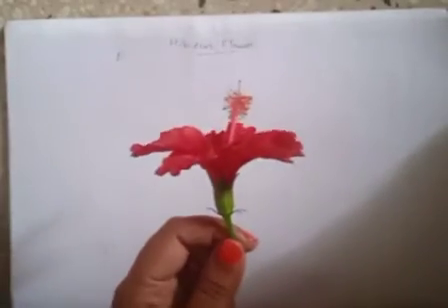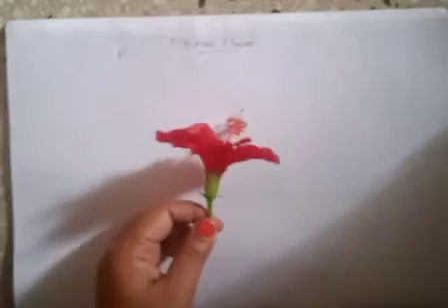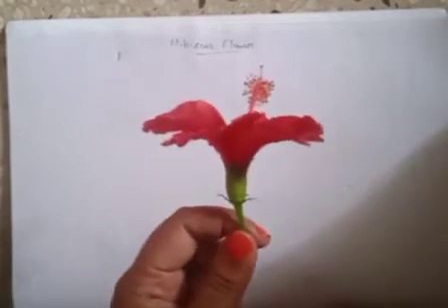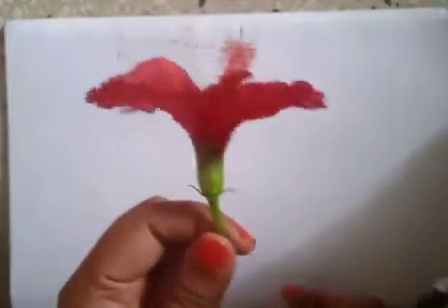So now I will go ahead and dissect the flower, and with that I will be writing the floral formula. So see, I said this is the epicalyx.